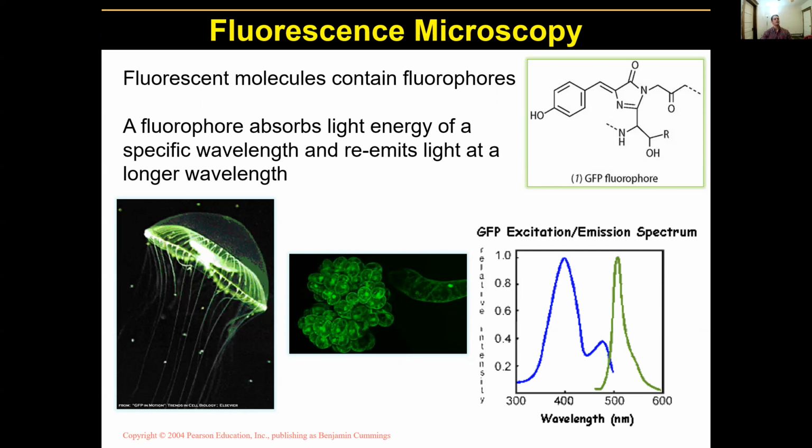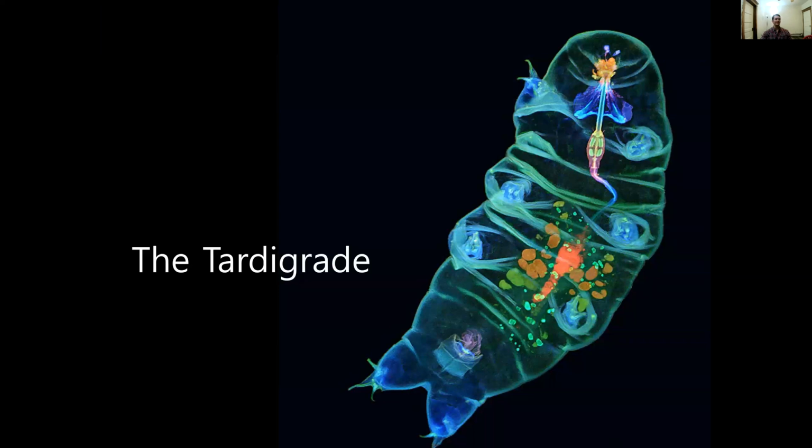Now, moving back to our friend, the tardigrade, here you can see a good example of all the detail that you can see using fluorescent stains. In this instance, this was actually the image that won the Olympus Global Image of the Year Award. It was by, I'm going to butcher this name, Tagide de Carvalho, who said of this image that they used multiple fluorescent stains and capitalized on the natural fluorescence of the samples.